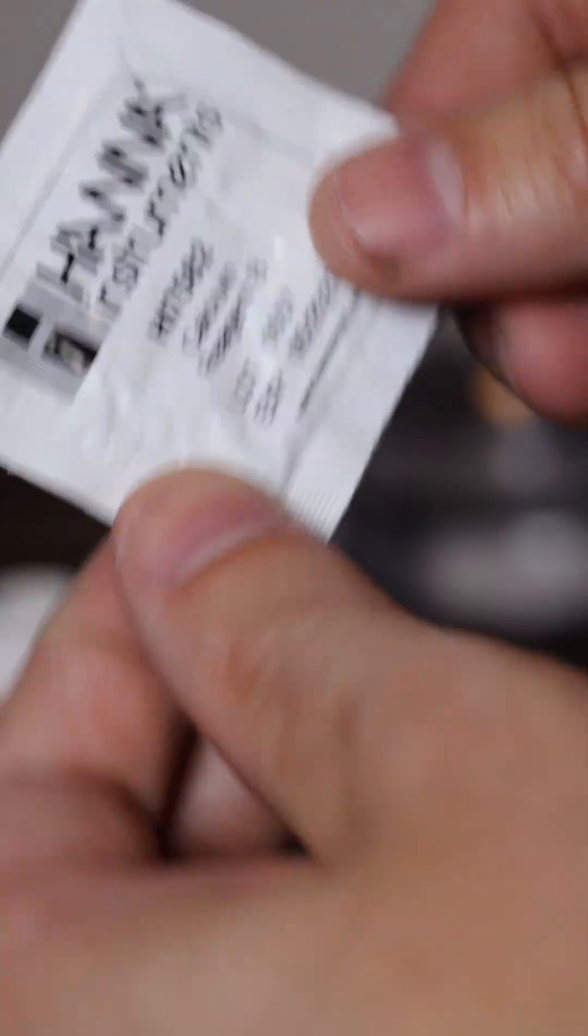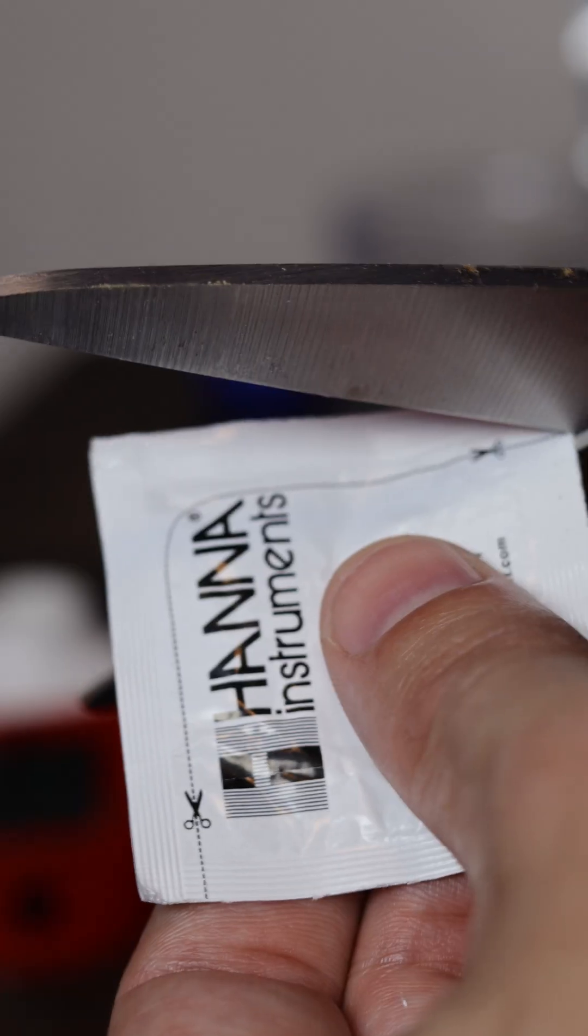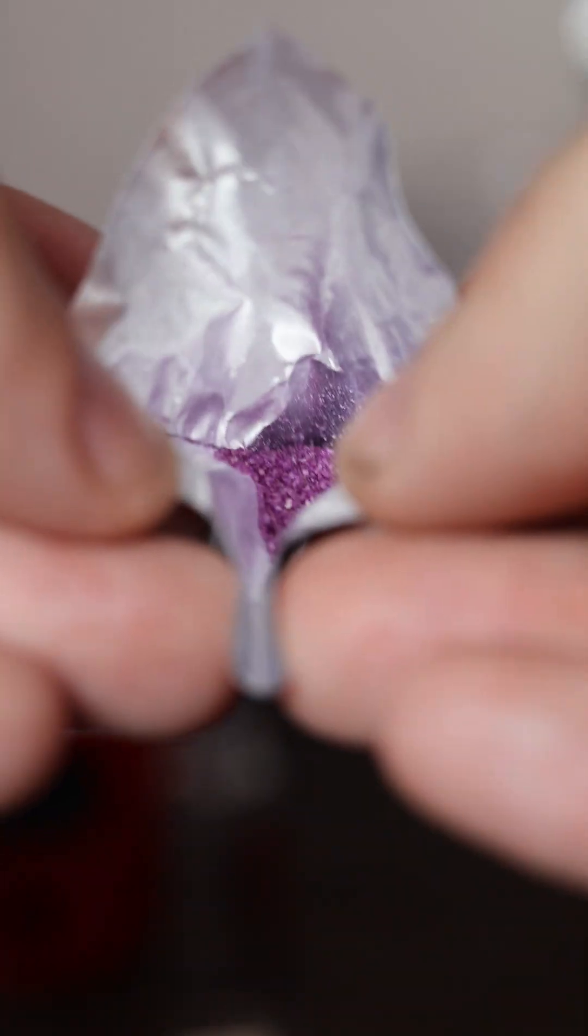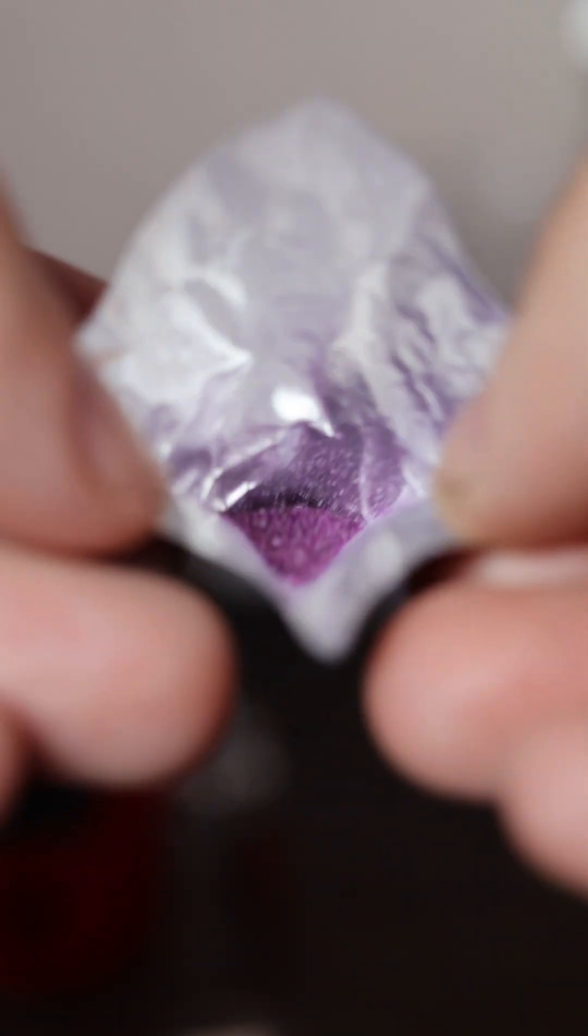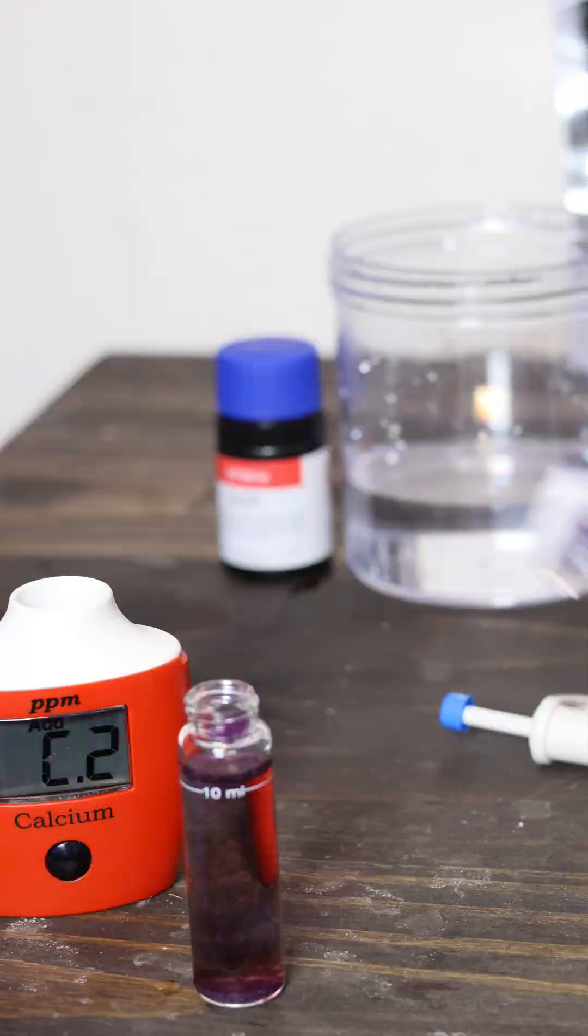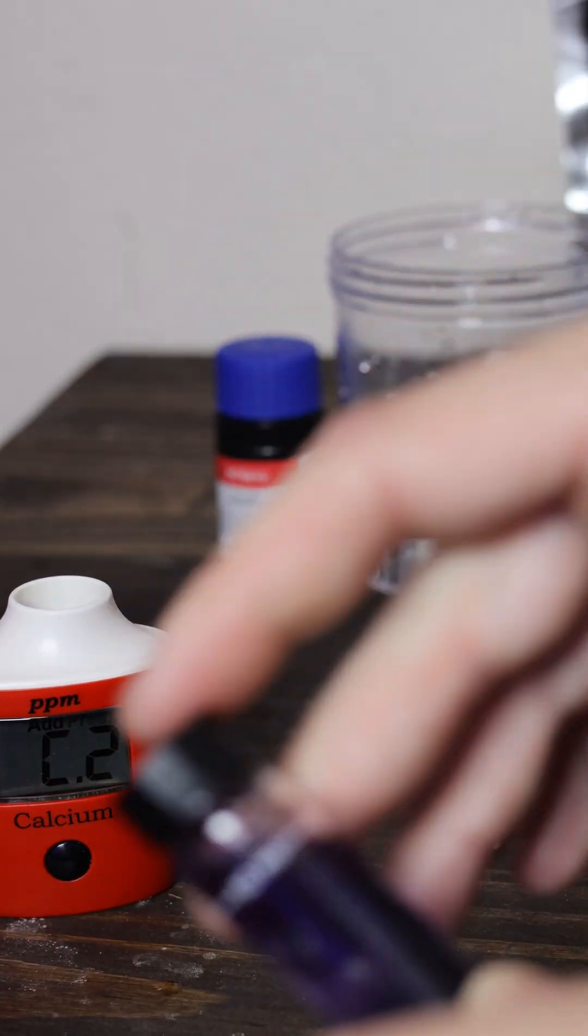Take the reagent B and get all of the reagent into the corner where my thumb was. Cut the packet on the dotted lines and to make the reagent easier to pour, put a crease in the packet like this. Pour the packet into the test tube. Make sure that all of the reagent dissolves and then clean the test tube again.